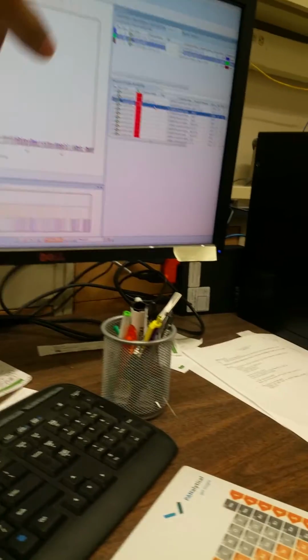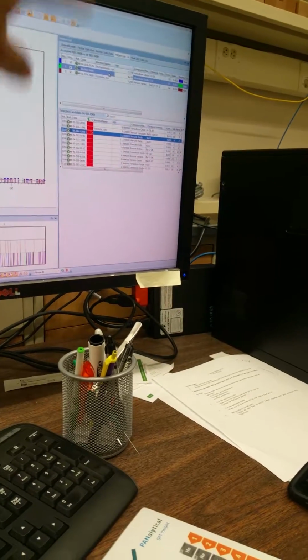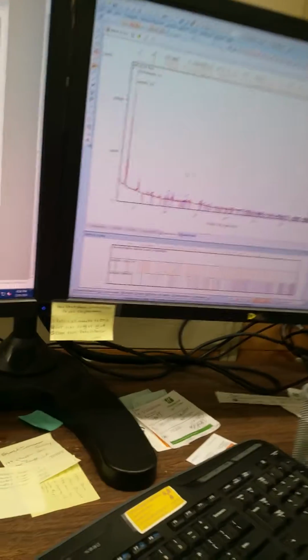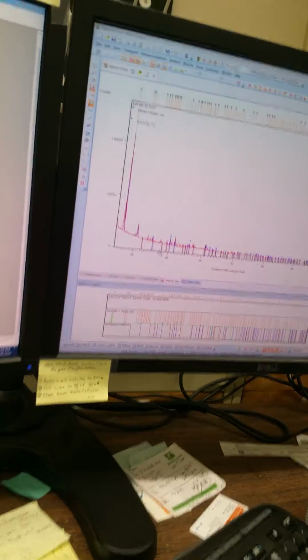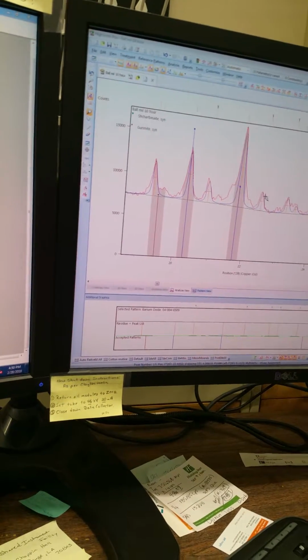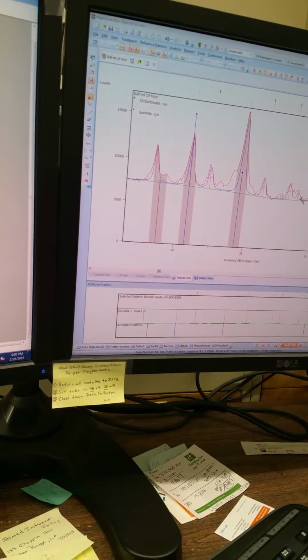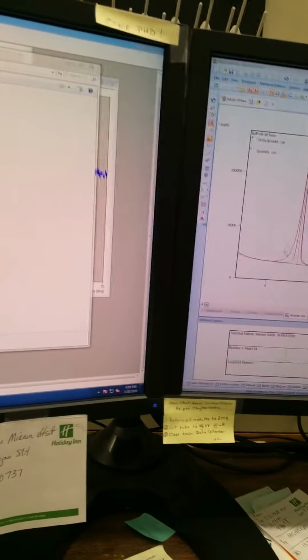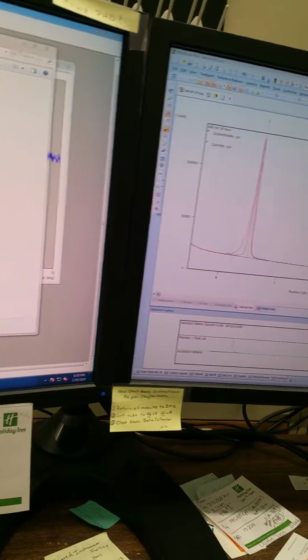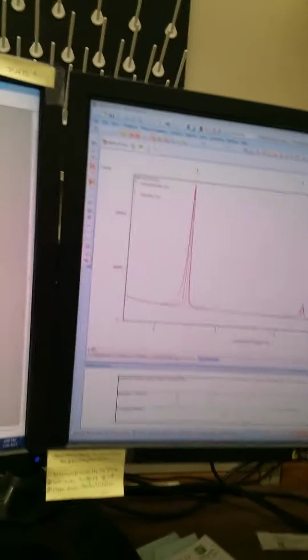Suppose if we select this, I understand this 3 is this material. So how to fit this? Oh, they're already fitted. For example, you see the blue ones. This belongs to that, this belongs to that. These peaks are unidentified yet. So what about the big peak? This one? The big peak, it's not identified. I want that big peak. So how to easily understand that this is the big peak?